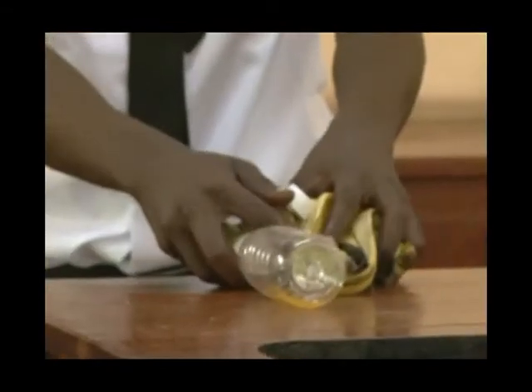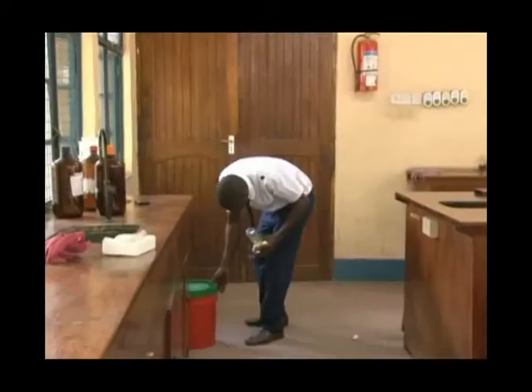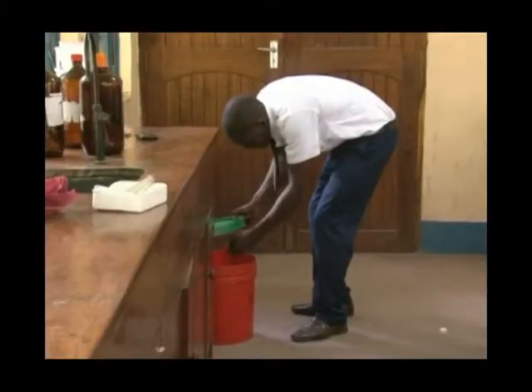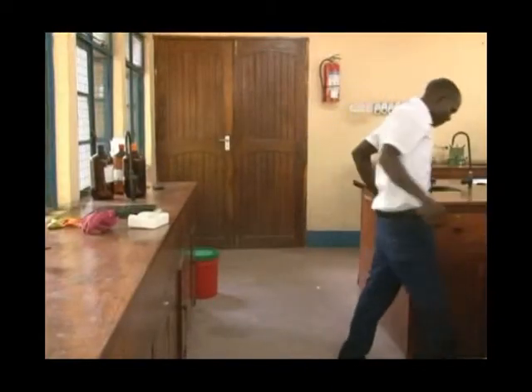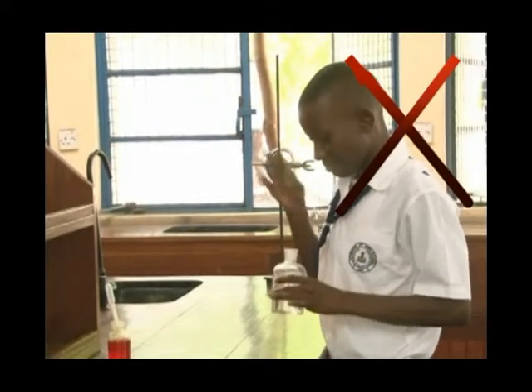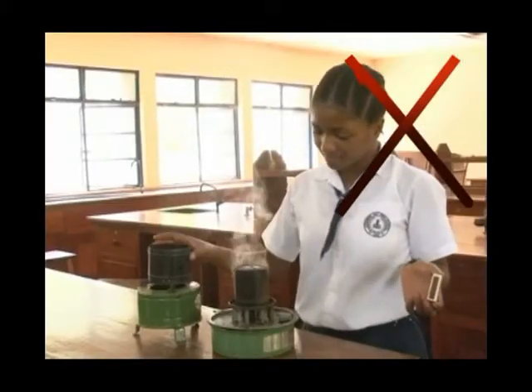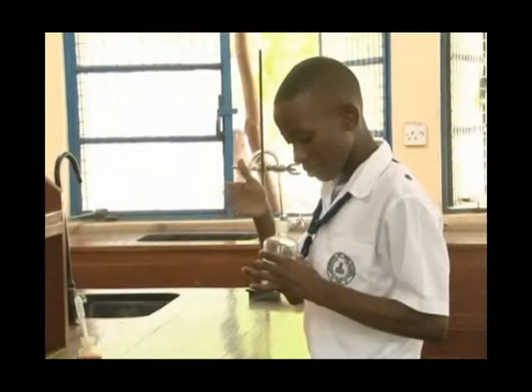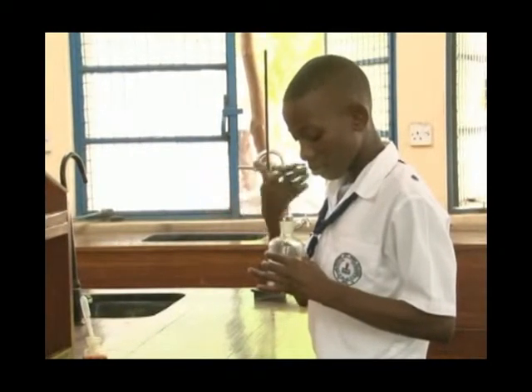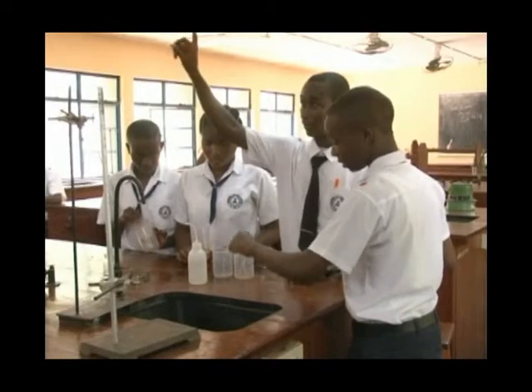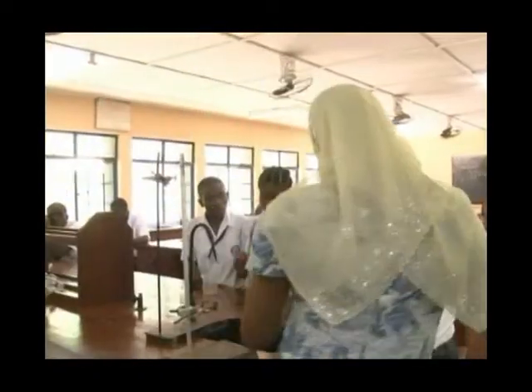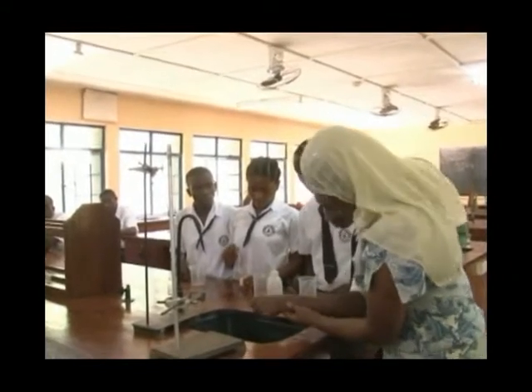Rule number six: always dispose of all used chemicals, specimens, or substances in a safe manner in the dustbins. Rule number seven: never smell substances, specimens, chemicals, or gases directly, but direct the fumes carefully towards you with your hand. Rule number eight: any accident involving chemicals or apparatus in the laboratory must be reported immediately to the teacher or instructor in charge.